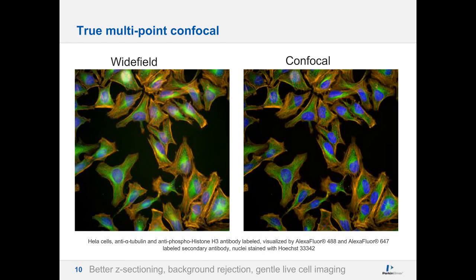We need a lot of light. We need a high excitation energy to also enable true multi-point confocal scanning. The benefit of confocal scanning is clearly to reduce background noise and background blurring. It also improves the resolution in X, Y, and Z, as you can see on these two images. The left-hand image is a wide field image acquired on Operetta CLS. The right-hand image is the confocal image that matches the sample. And if you look carefully, you can see the improved resolution both on the actin fibers and also on the antibody stain here.